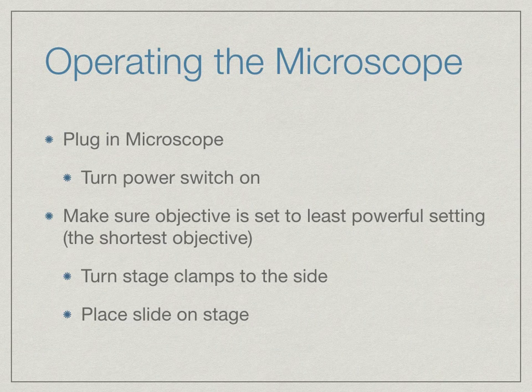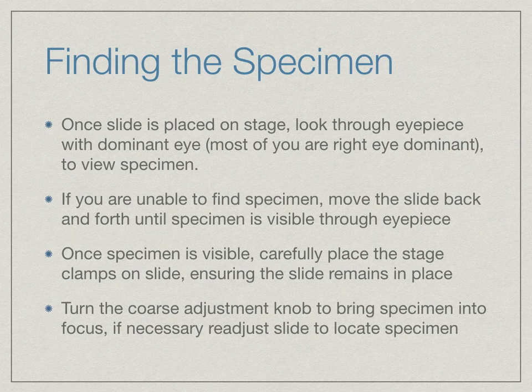At that point, you can either turn the stage clamps to the side and place the slide on the stage, or slide the slide underneath the stage clamps. If you turn them to the side, go ahead and slide them back over the slide to hold it in place before moving on. When locating the specimen, once the slide is placed on the stage, look through the eyepiece with your dominant eye. Most of you are right eye dominant; if you are not sure, try each eye and see which feels most comfortable.